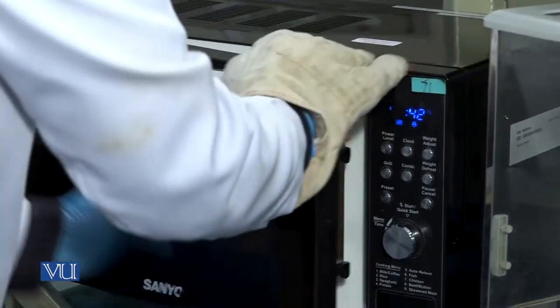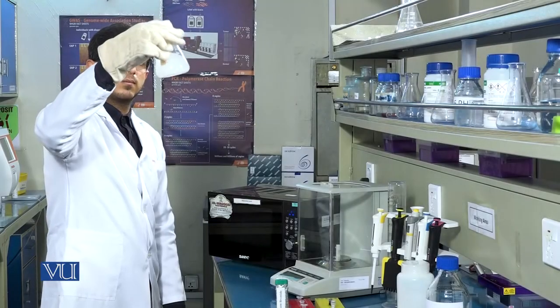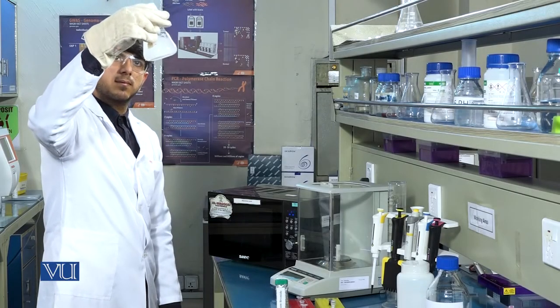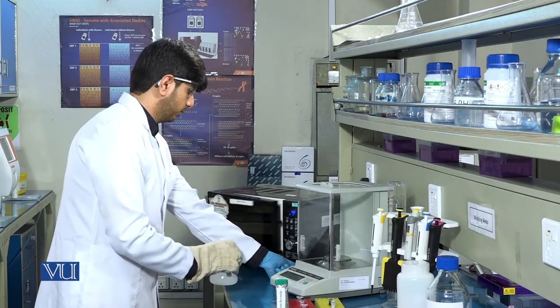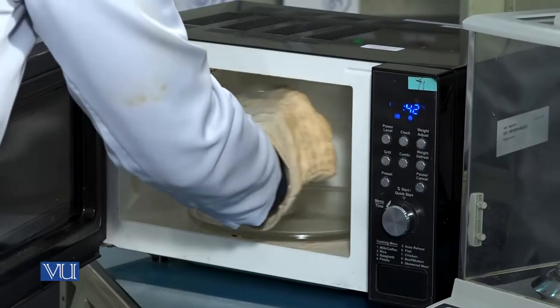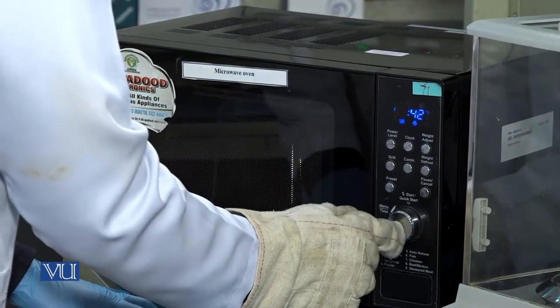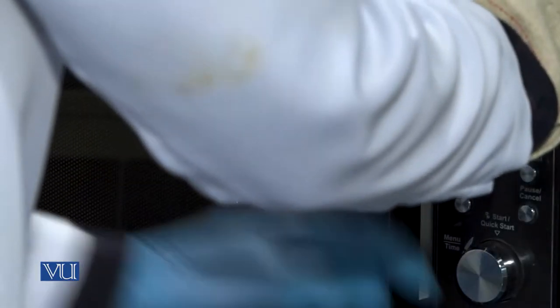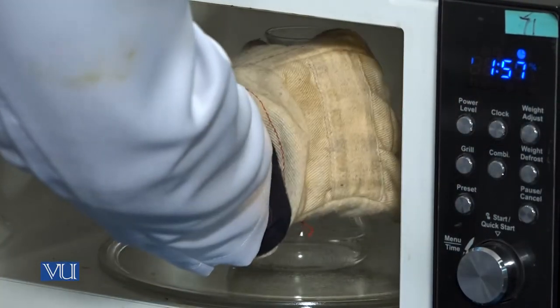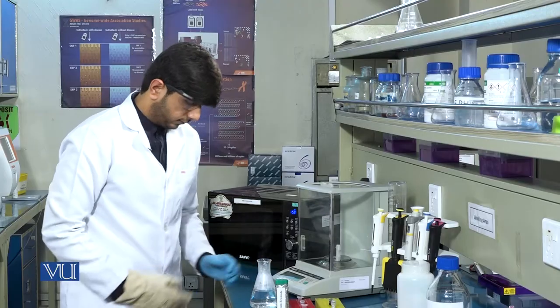After 1 minute, take out the flask with the help of a heat-resistant glove and see whether the contents have dissolved or not. If the contents are not dissolved, place the flask again in the oven until the solution becomes clear. Let the flask cool for some time.